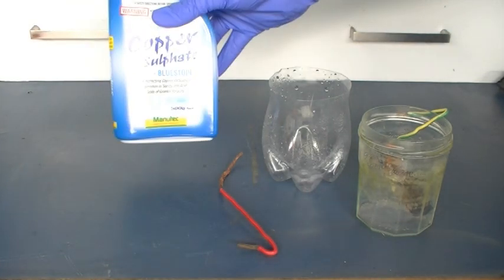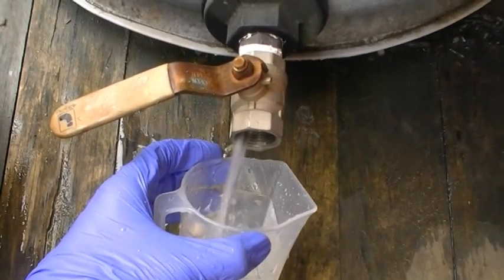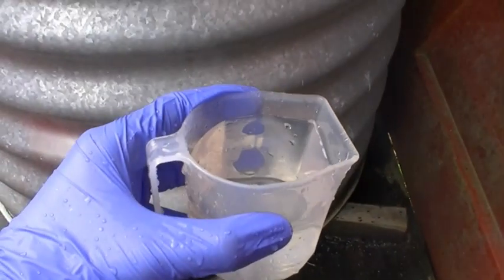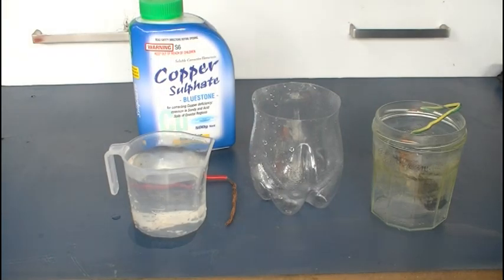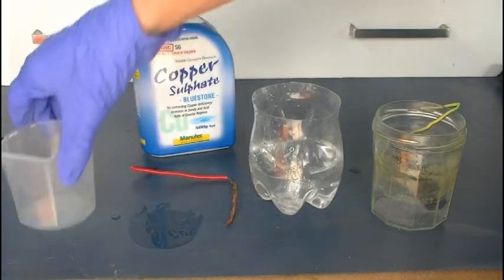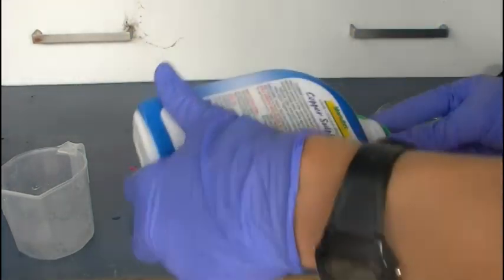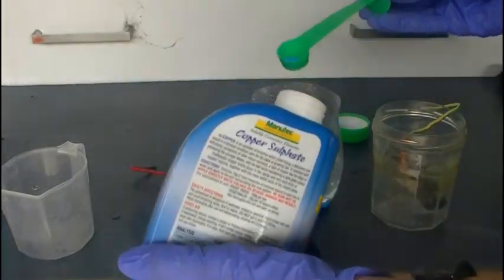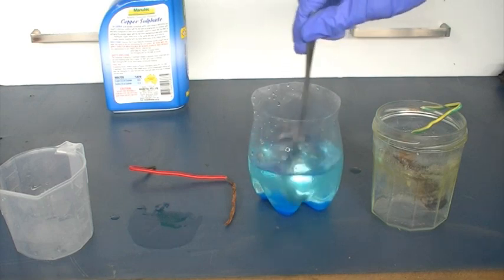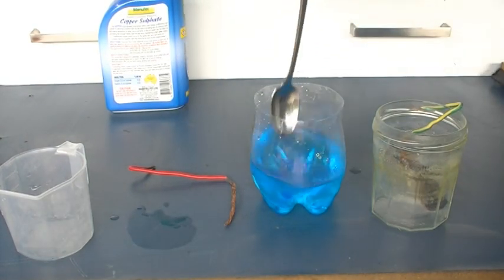So obviously the first thing we're going to need to do is create a copper sulfate solution with distilled water. Rain water should do pretty well for this. See here I've got around 200 millilitres. So to make our copper sulfate solution we'll add our 200 millilitres of rain water to the vessel we'll be doing the electrolysis in, and then add around 15 grams of copper sulfate. That should be around 15 grams. And we'll stir it to get it all dissolved. Alright, all done.